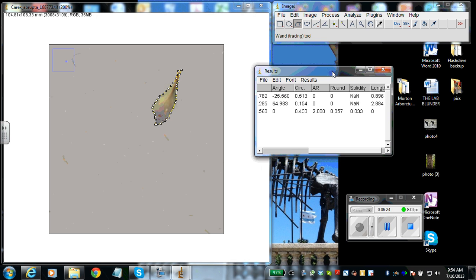and here are our results. And so it gives us a whole bunch of numbers, right? Follow the protocol and write down all the numbers that it needs. So we have the area here, you have the X and Y coordinates so that the scientists can look up what perigynia you're looking at if they need to check, for precision, accuracy, circularity, and then obviously we have our width and our length. So we've just done the perigynia. So now we can save these results if we want to.